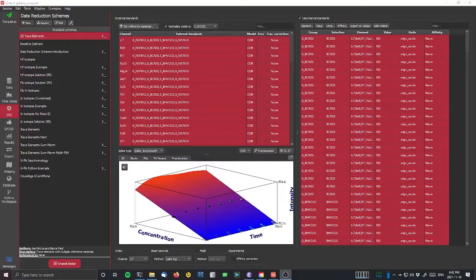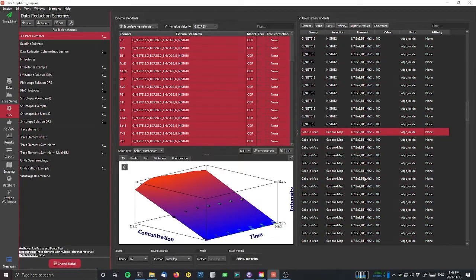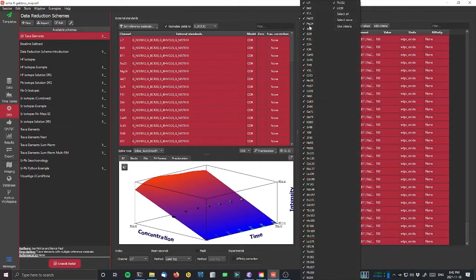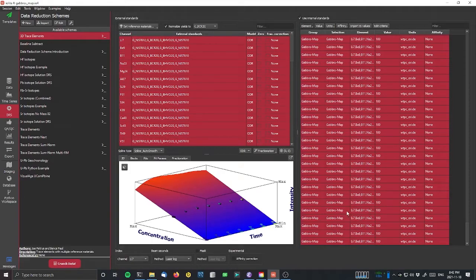and we'll be putting an example like this in our publication. One thing that I forgot to mention about using criteria is that we need to tell iolite for which selections we want to use criteria. So we can scroll down, and in this case we're only going to use it for our map, so we can just select all of our map selections. And then here in the elements, instead of using our list here, we're going to say use criteria. And that way it will know to use the criteria values instead of the values that we've set in this table.